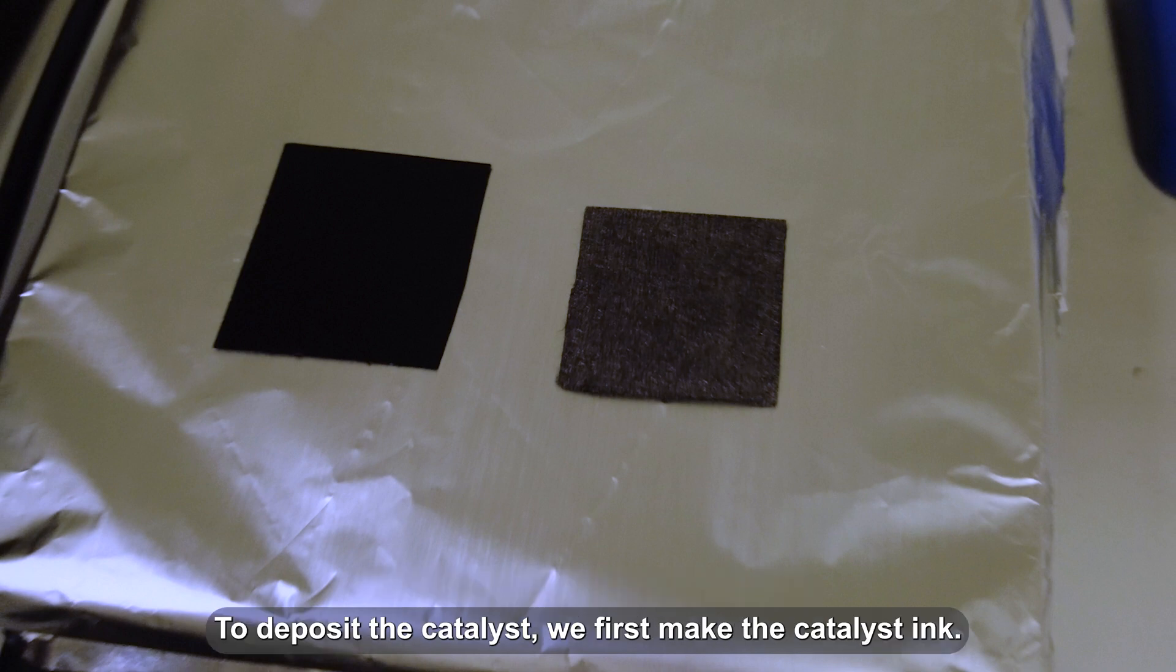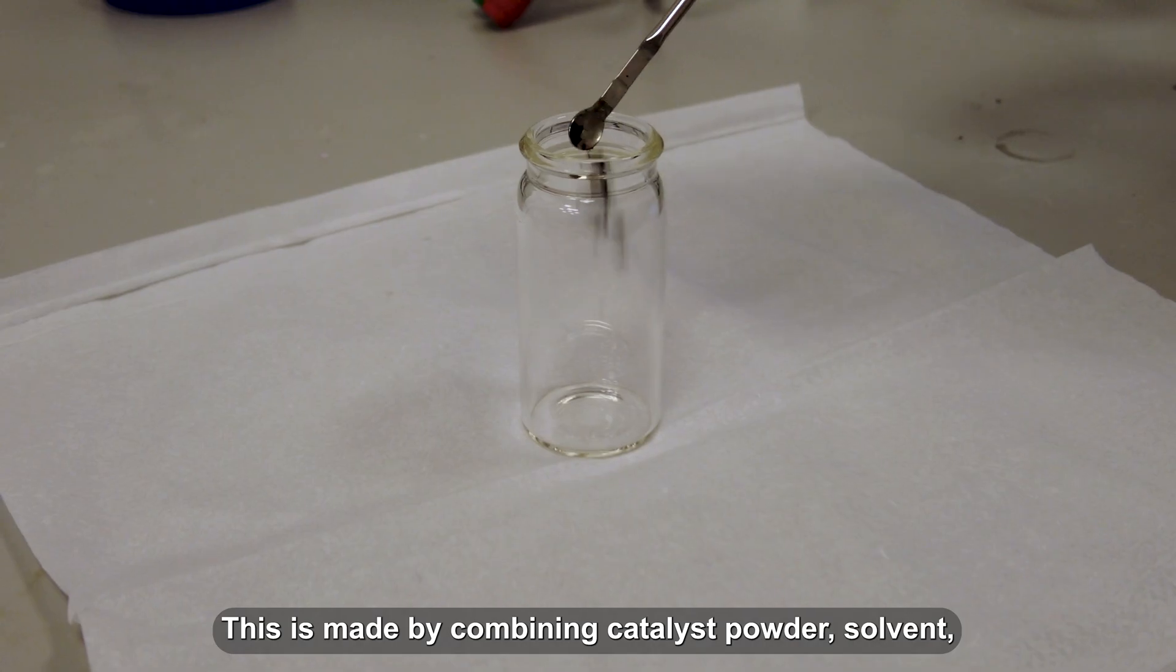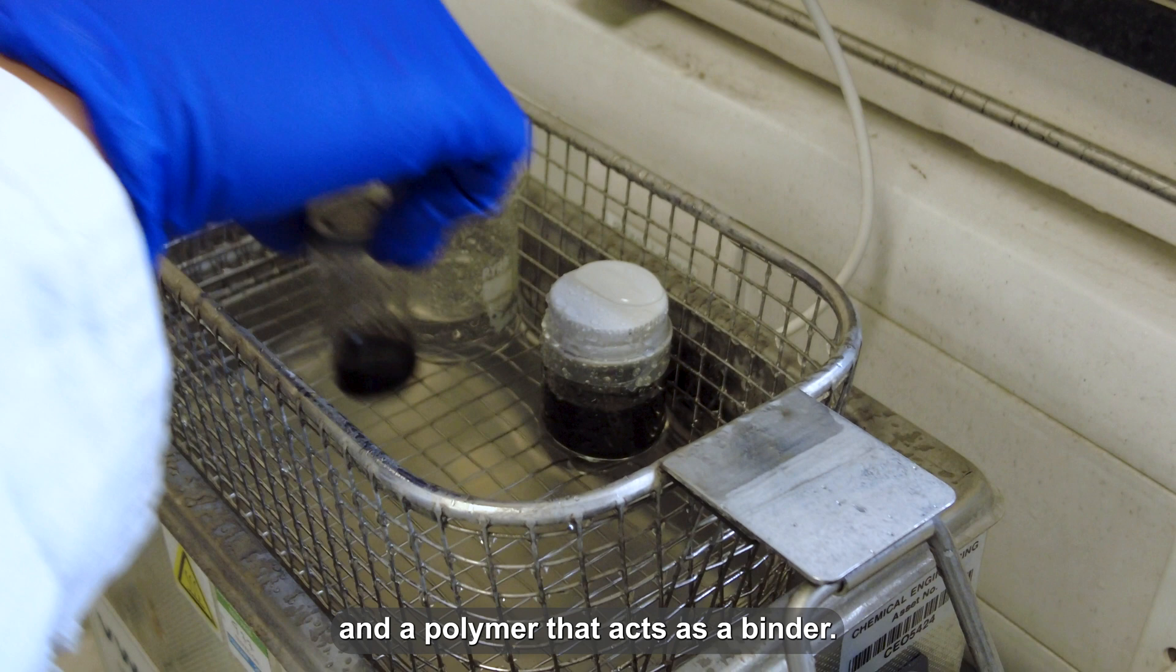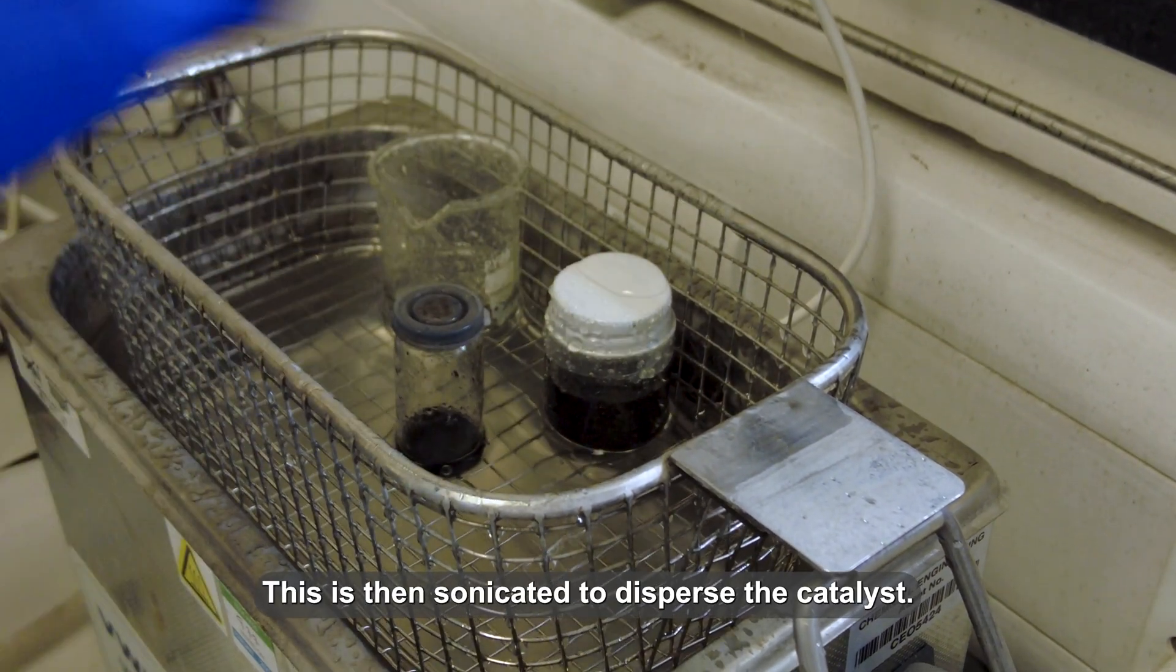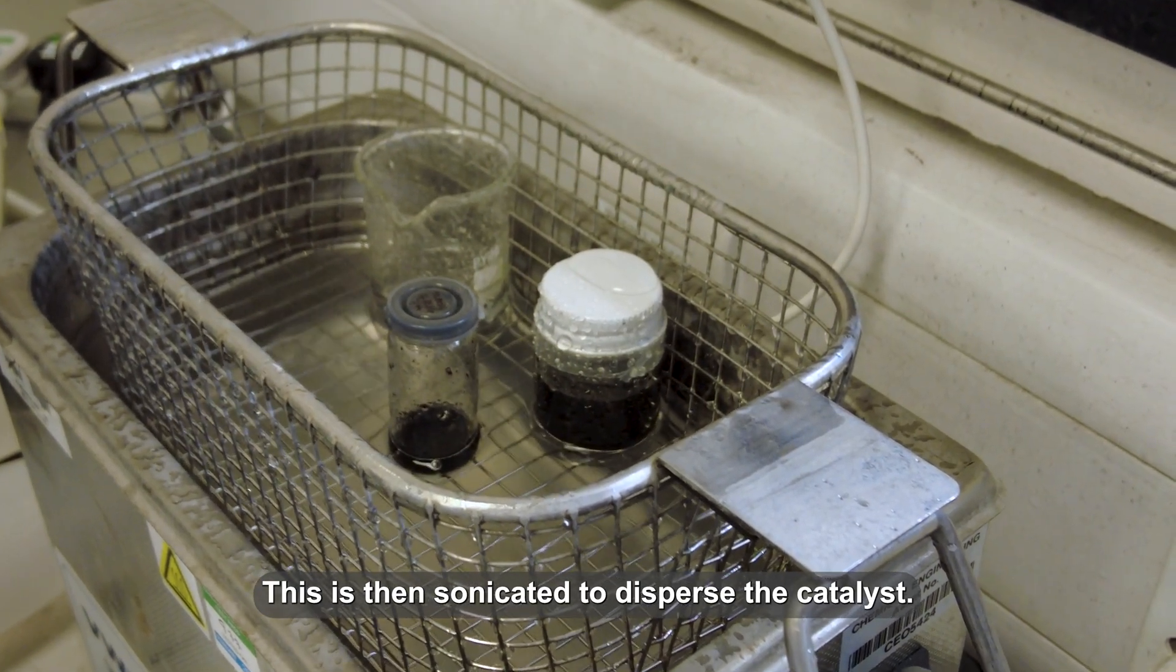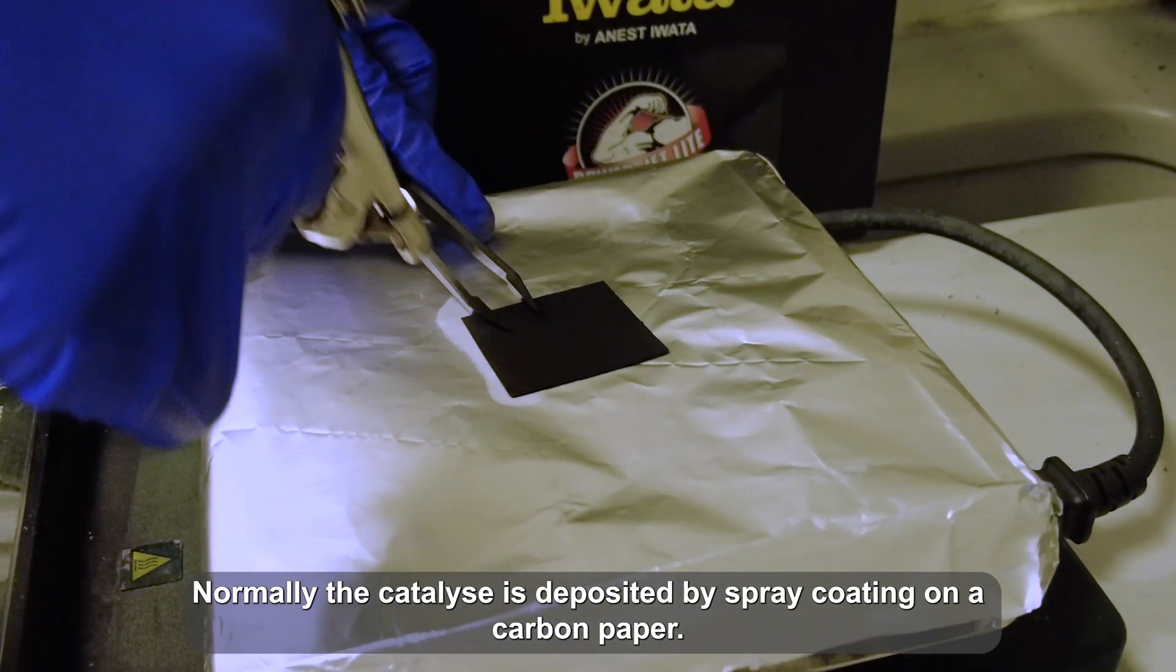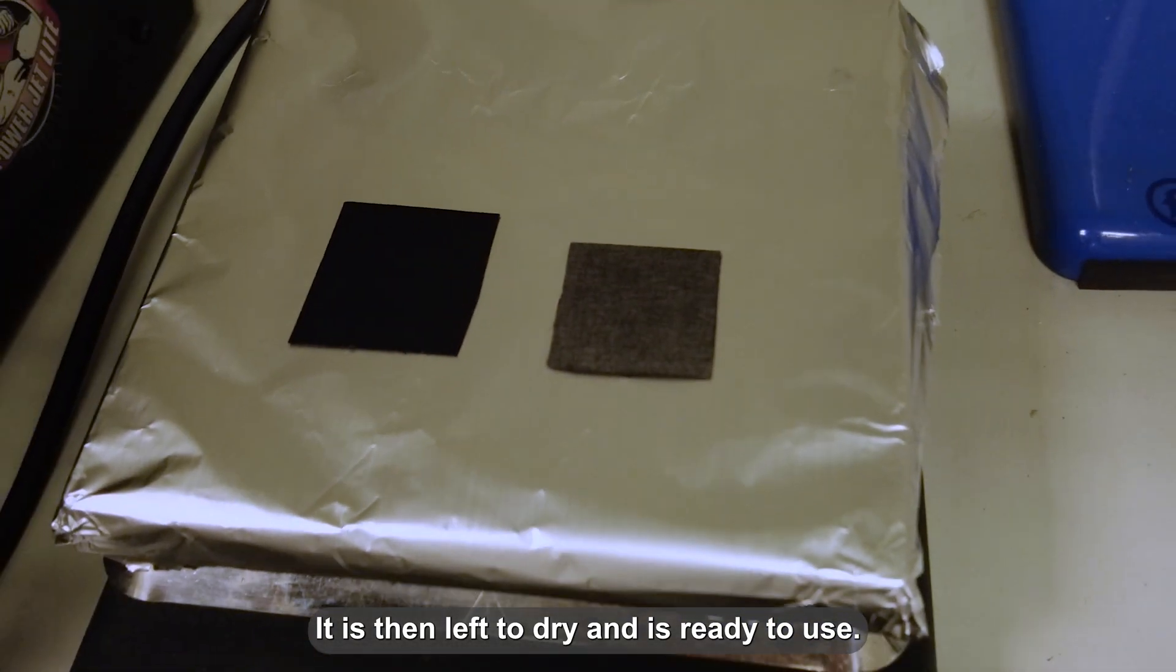To deposit the catalyst, we first make the catalyst ink. This is made by combining the catalyst powder, solvent, and a polymer that acts as a binder. This is then sonicated to disperse the catalyst. The catalyst is deposited by spray coating on carbon paper, left to dry, and is ready to use.